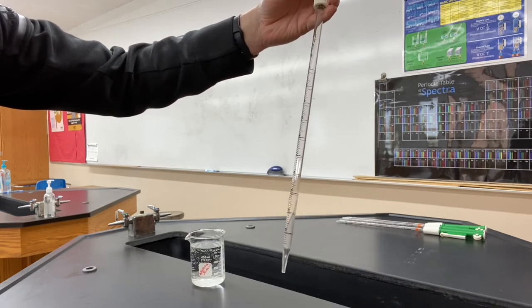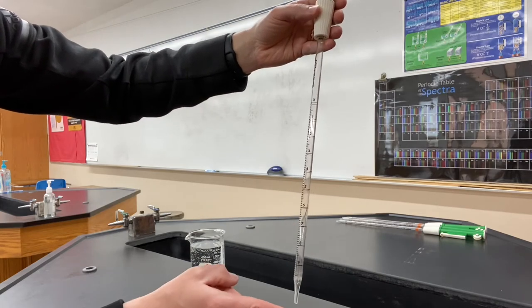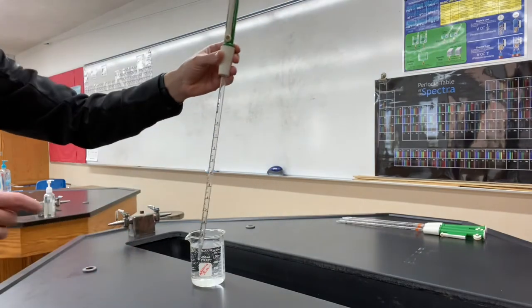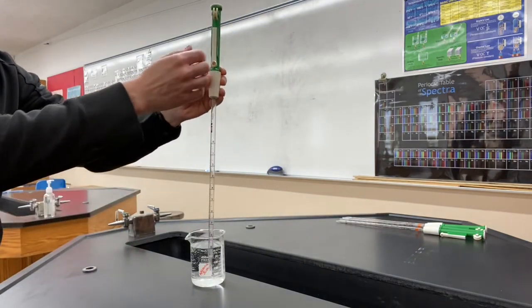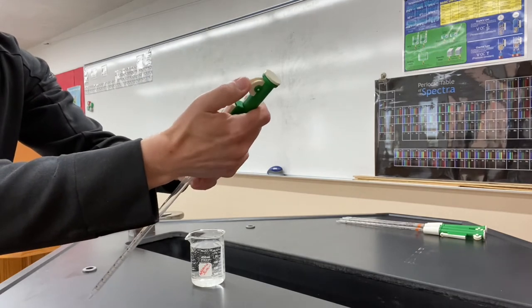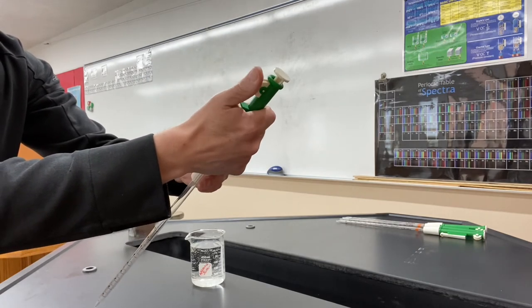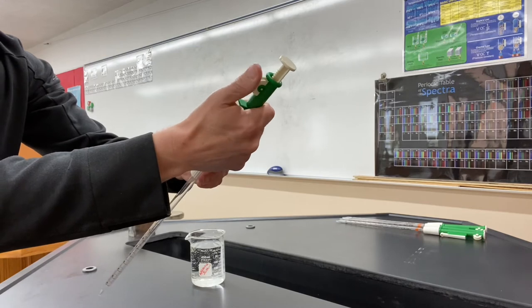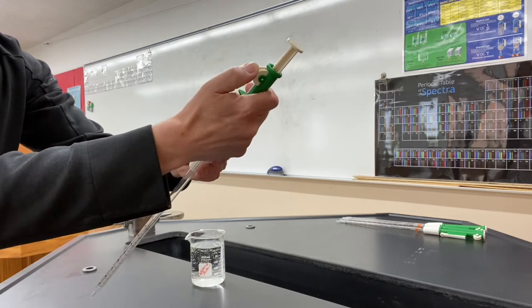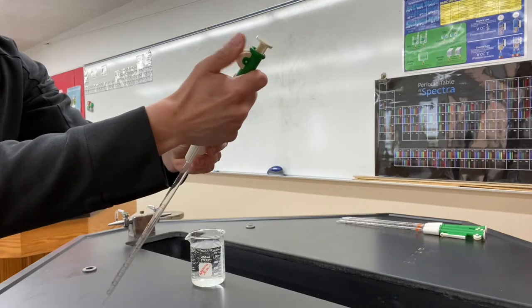So if I want to go ahead and fill this up with 10 milliliters, I need to fill up the entire tube up to the 0 mark. And the way I do that, there's a couple of different ways. The best way to do it precisely is to use the little thumb wheel. As you turn the thumb wheel, the plunger goes up and it will draw water into the pipette. So let me show you what that looks like.